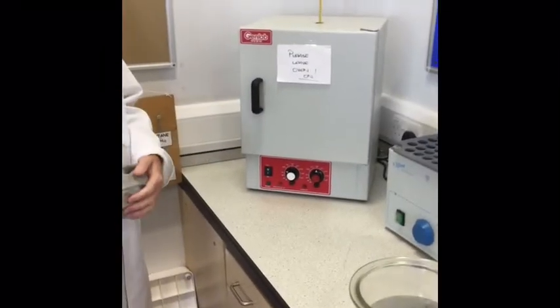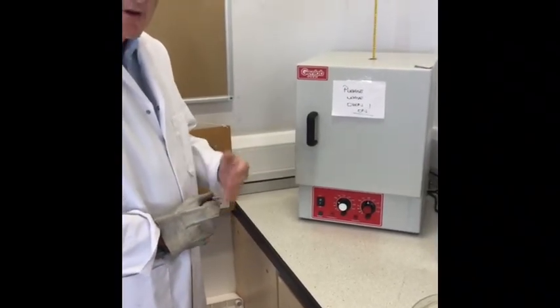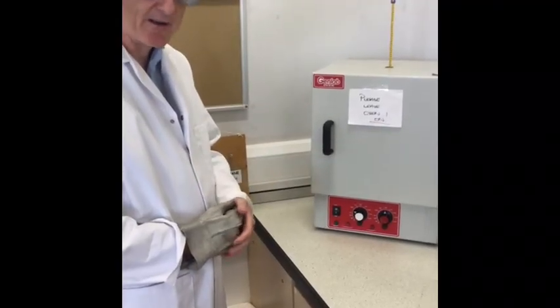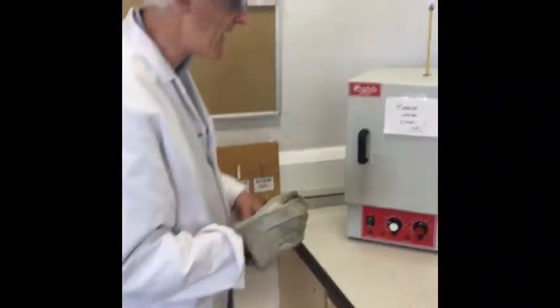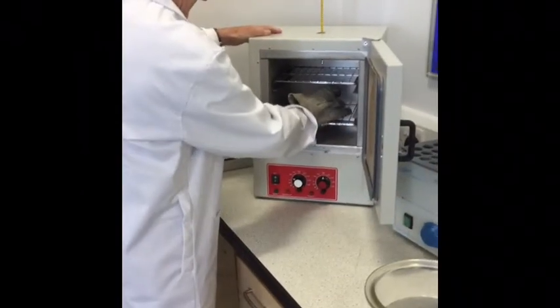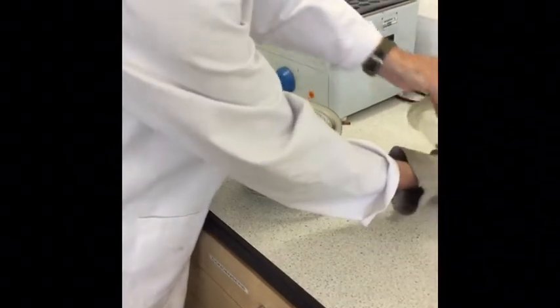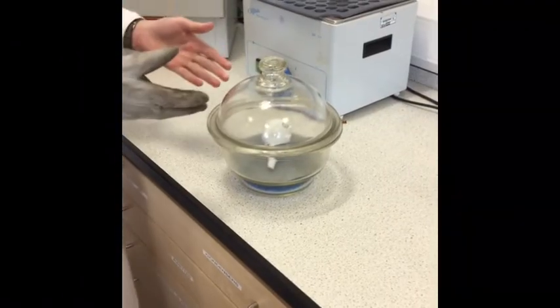The sample's been in the oven for about an hour now at 100 degrees, so we want to take it out and weigh it. But of course we can't weigh it while it's still so hot, so we have to let it cool down in a desiccator before we can weigh it. So it'll be very hot, so make sure you have a glove. So put the sample in the desiccator. Put the lid on and leave it to cool down for maybe about 10 minutes.